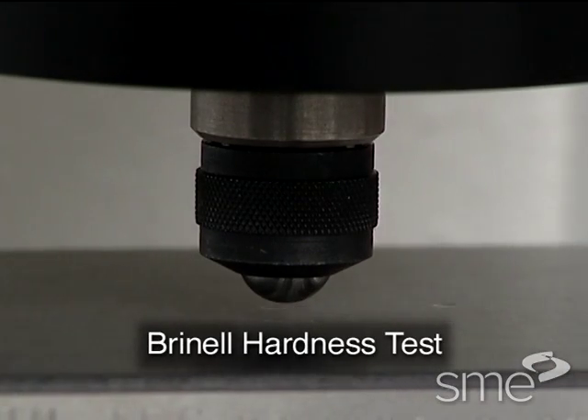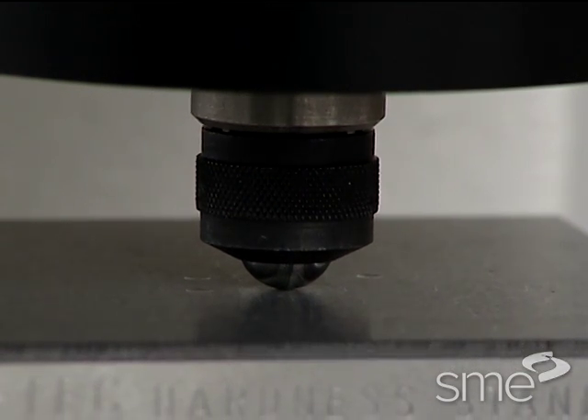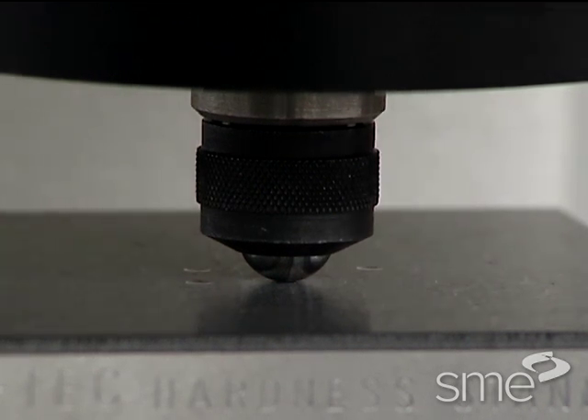In the Brinell hardness test, a known load is applied for a given period of time to a specimen surface using a hardened steel or tungsten carbide ball, causing a permanent indentation.